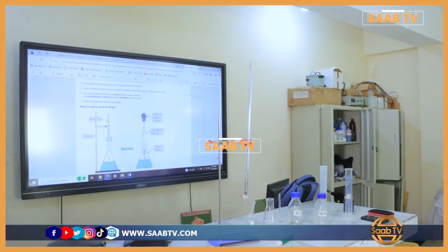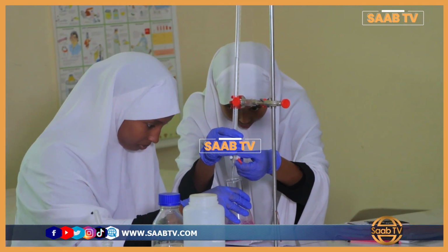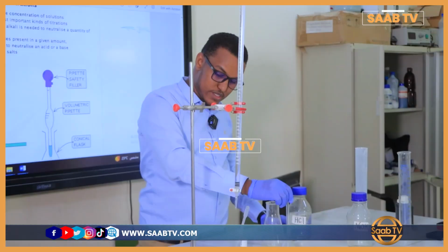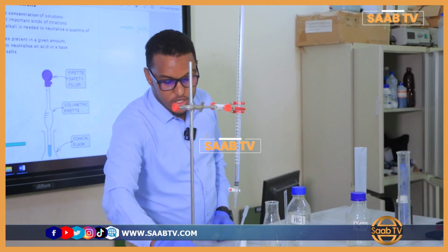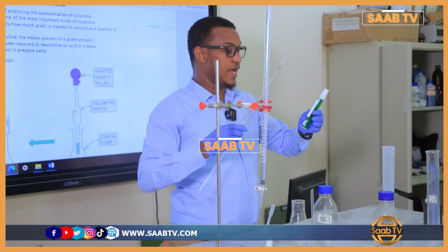So let me ask you about the instruments that we need to do the practical for titration. I will ask you the questions and then you will try to answer. The first instrument that we need will be, what's called that one? Funnel. So we need the funnel. As well as we need, what's called that one? We need the pipette. And the other one will be?